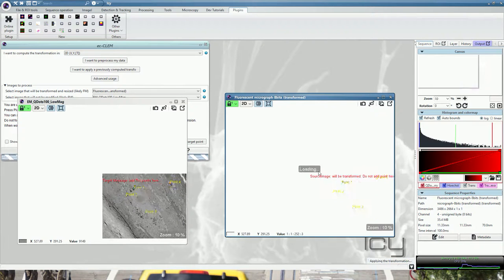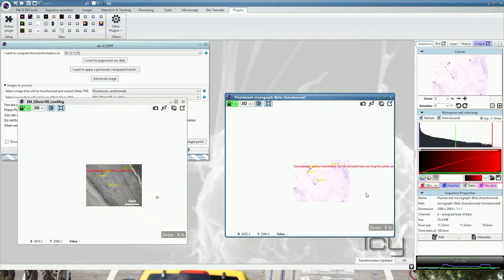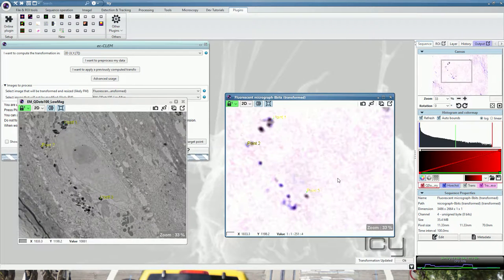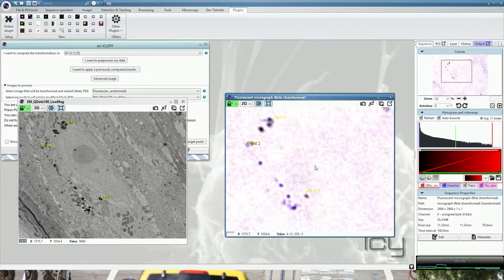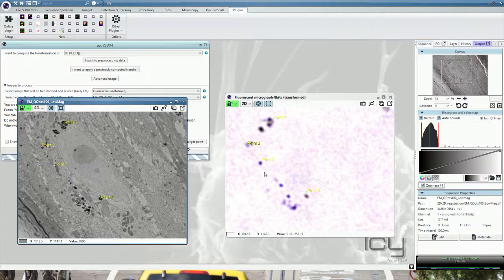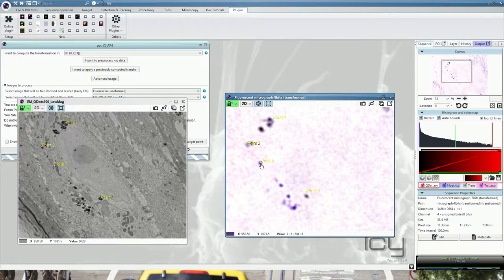Notice that when I navigate through the images, I always use the mouse, because clicking points will add points to the layers. You can add points and correct them.